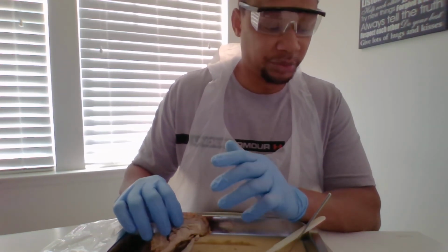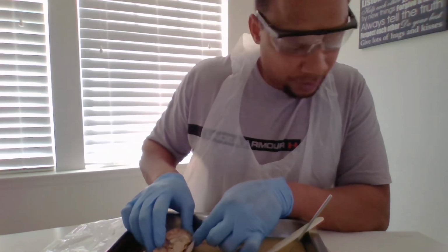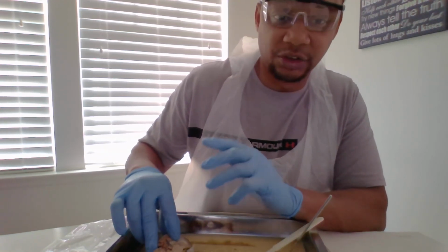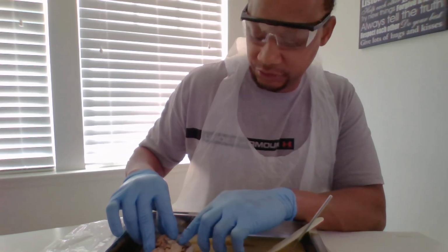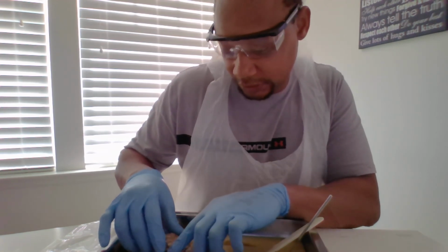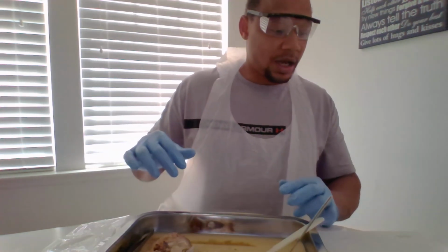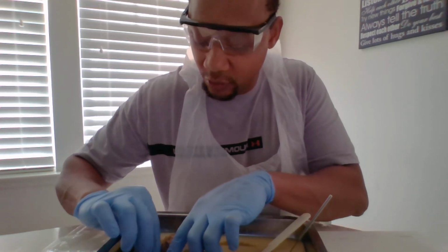For your ventricles, which are filled with fluid, the first one, the lateral ventricle, is this right here, which contains your septum pellucidum and your choroid plexus. I'm sorry, the third one is right here, and then the fourth one is right here, in the cerebellum back here.